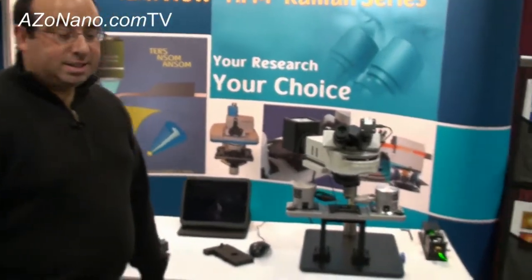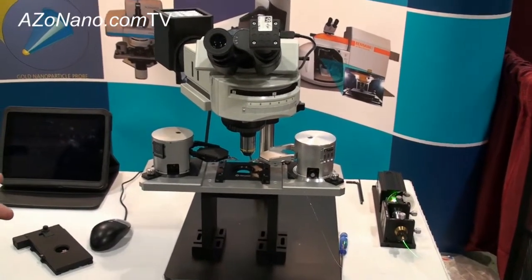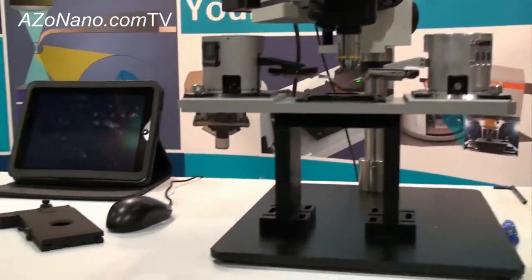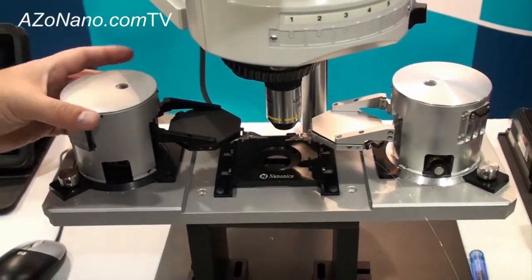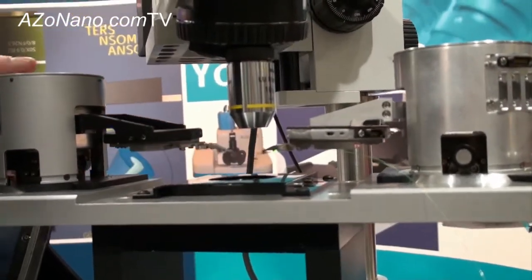What we have here is our multi-view series, which is a series of different scanning probe microscope systems that are optically open, meaning they're completely exposed from the top and from the bottom, and this is true for the whole series. We have here our single probe SPM system and our multi-probe, and each one of these towers is an independent AFM system. We can have up to four different towers working together.